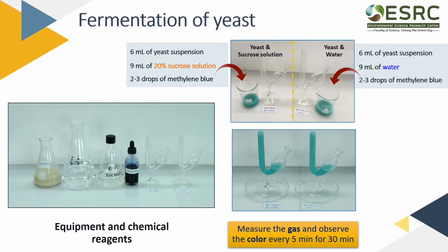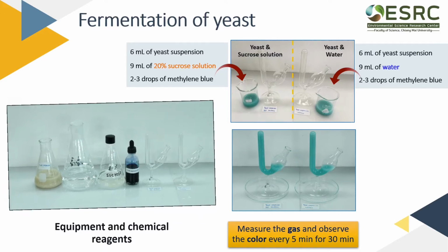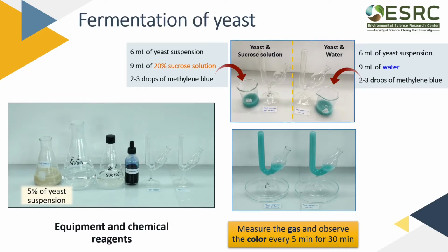We are going to start with fermentation of yeast. These are the chemical reagents and the equipment: 5% yeast suspension in warm water and 20% sucrose solution.